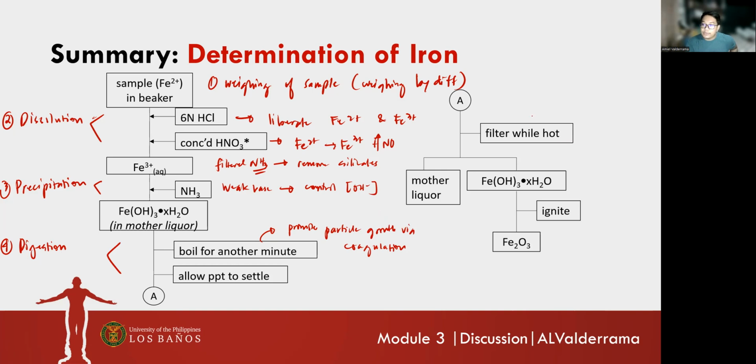So why do we filter it while hot? Since pag mataas ang temperature ng ating solution or mixture, bumababa yung viscosity. Hence, mataas yung flow rate. Pag mataas yung flow rate, faster filtration, less tendency for prolonged digestion.